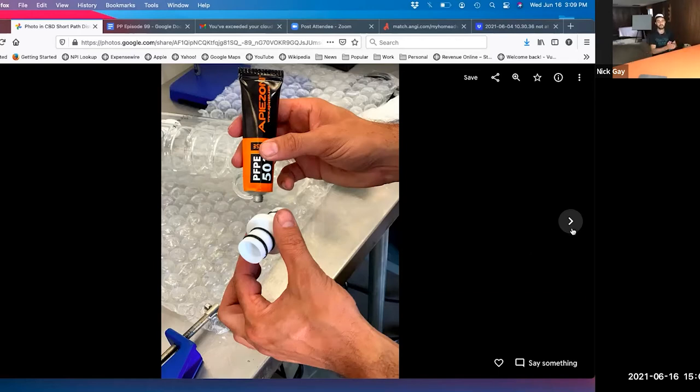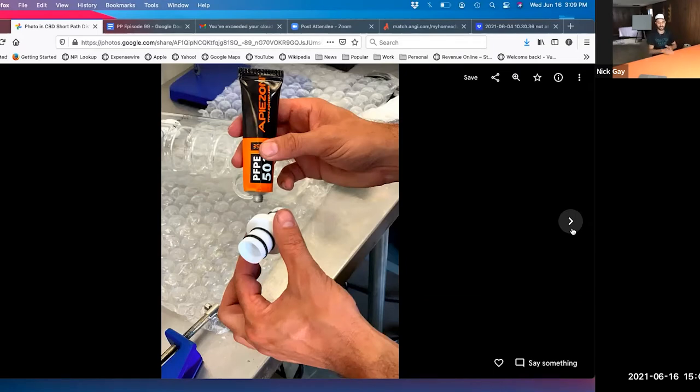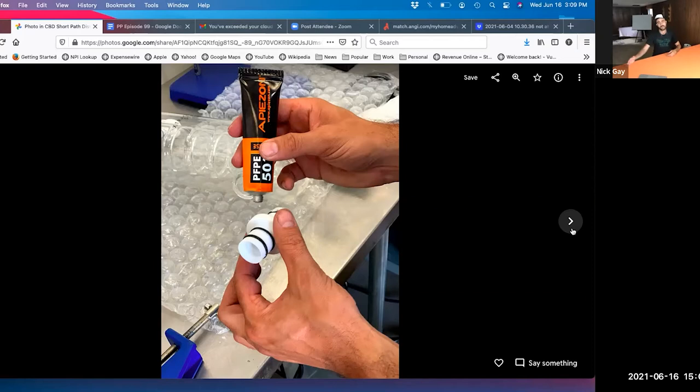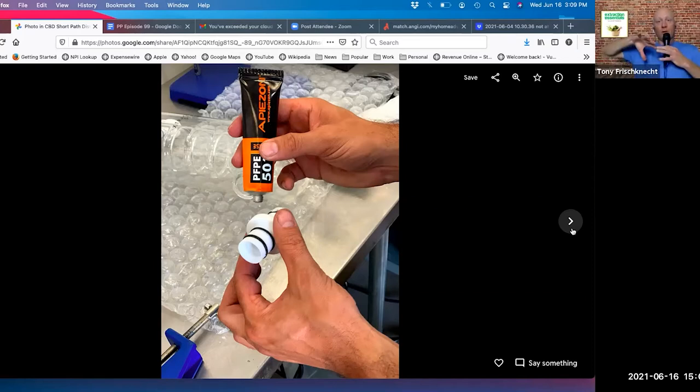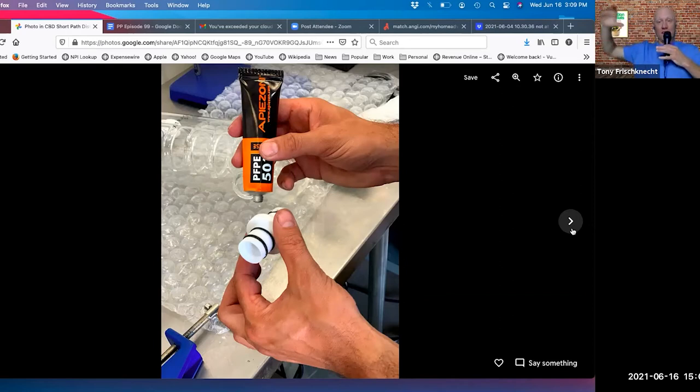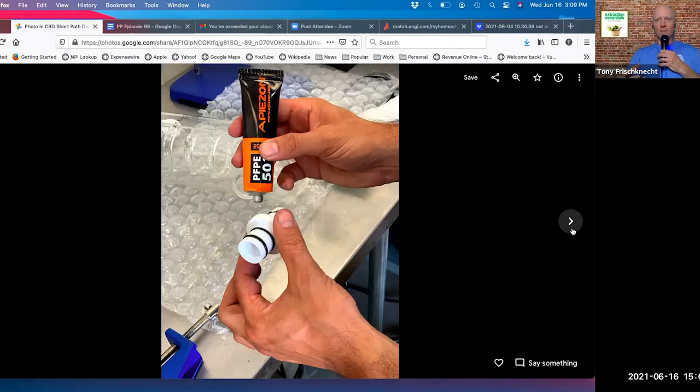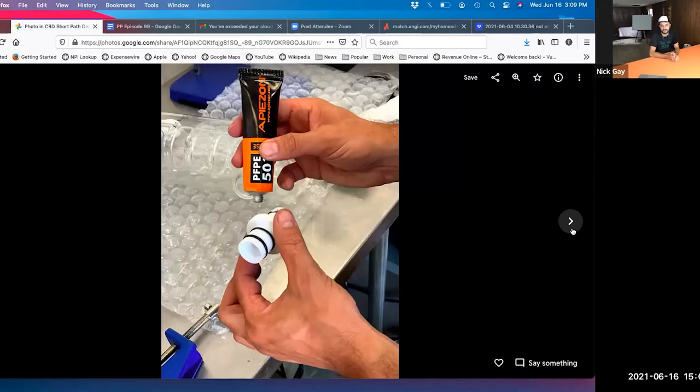You're going to want to grease up every single joint and every single connection with this vacuum grease. It creates a better seal and provides lubrication so your glass joints don't get stuck, which could end up breaking stuff. You're going through the entire setup making sure all the joints are vacuum seal tight so you can have a very efficient system.